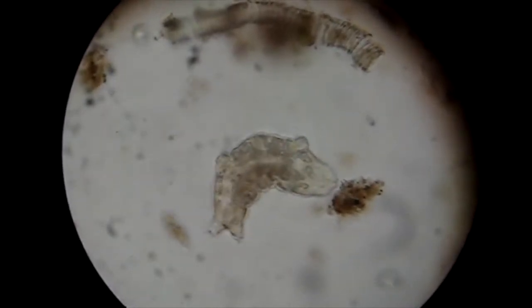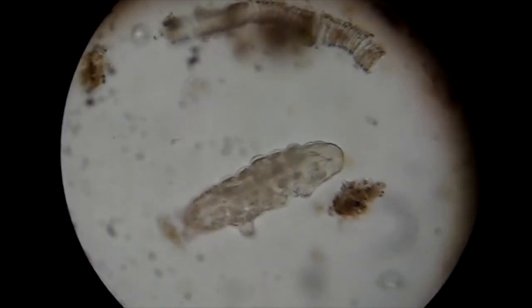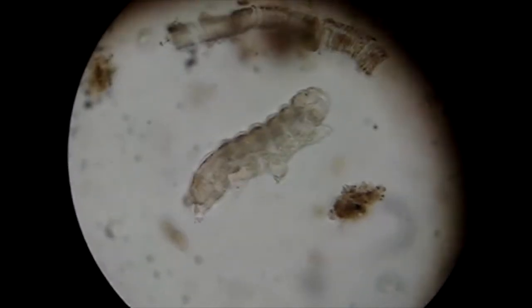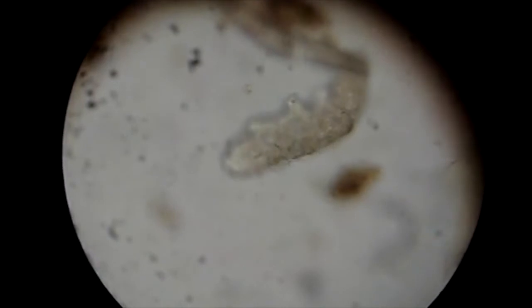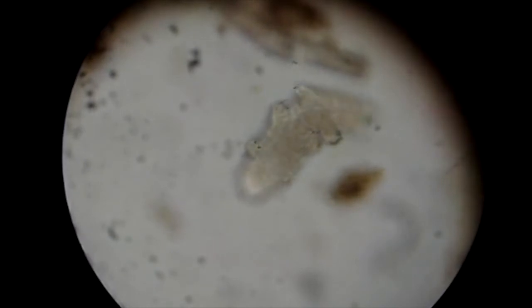So anyway, they're really cute, these things, and a lot of people call them water bears or water piglets. They've got 8 legs with 2 claws on each leg, and they have this interesting swimming motion. They're found in ponds, but they can also be found in other aquatic and terrestrial habitats, like in moss. So if you ever want to find some of these and look at them yourself under a microscope, go out and collect some really damp moss, and you've got a good chance of finding some in there. There are different species on land compared to the ones you find in ponds, obviously, but they're all pretty similar to each other.